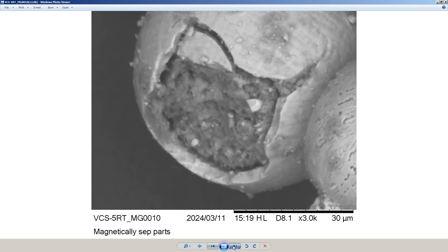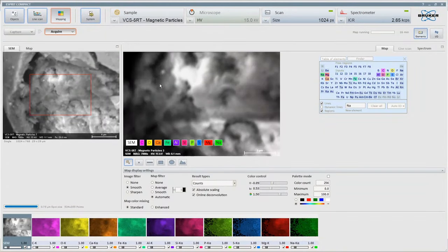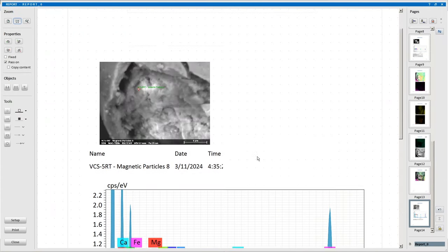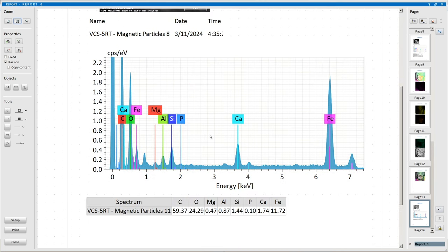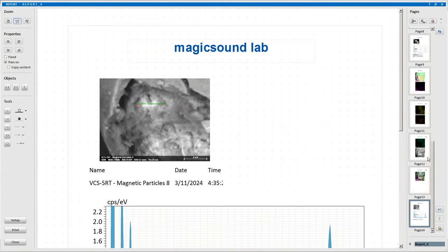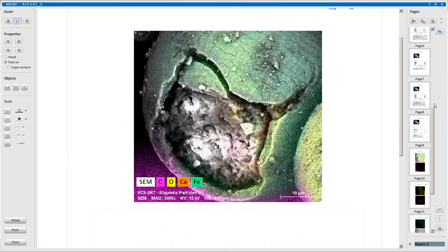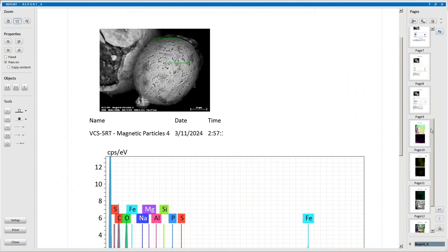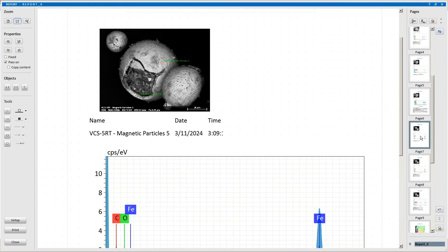And what's the core made of? Is there carbon in there mainly? Mostly carbon, yes. So here, I'm just looking at this spot because it's a bit lighter, but it's got iron, magnesium, aluminium, silicon, and phosphorus. The usual suspects for the broad spectrum of things that get produced. And the sulfur's starting to pop up too.